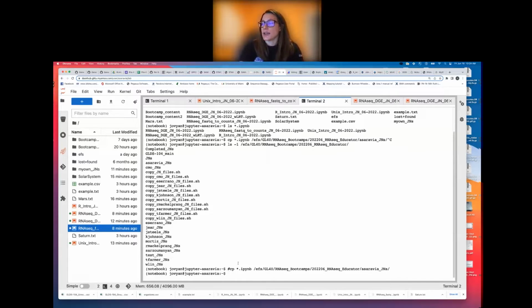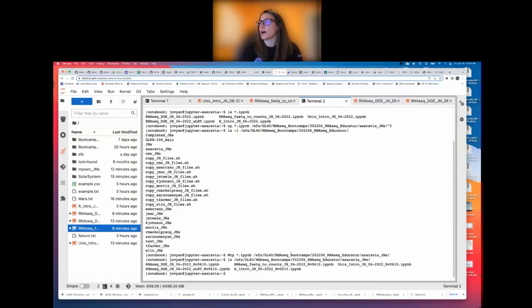Before I do that, I just want to show you what I have in mine, and same with all of yours. Oh, actually, you guys will have stuff. I just realized that I put that in mine. I must have copied this to show you guys, but all of yours will just, let me look at one of yours, unless you already ran the command. So, Chief, I'm going to go ahead and look at yours.